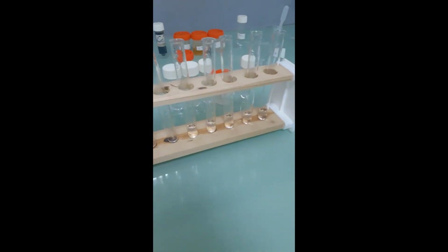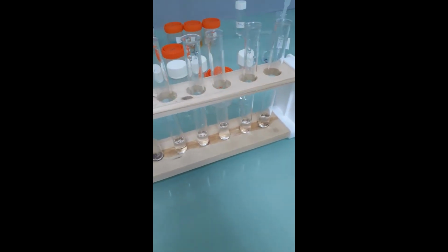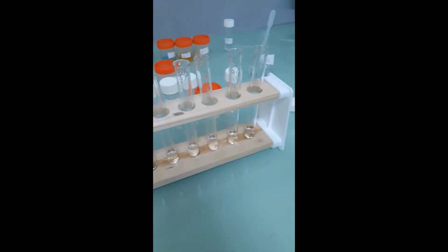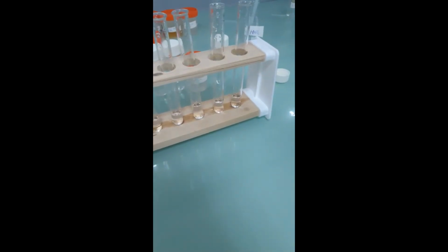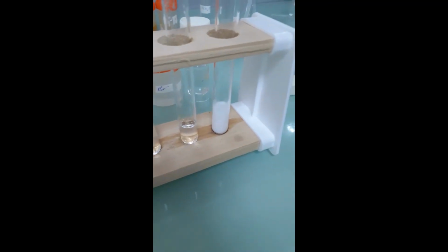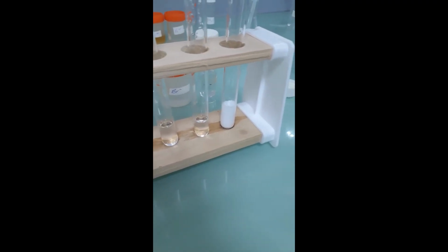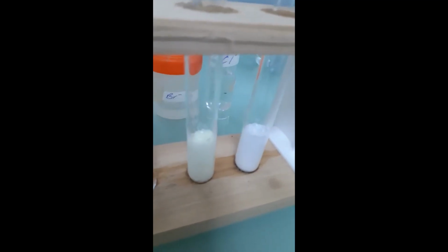Okay, so this is a test with silver nitrate solution. We're going to add it to chloride, bromide, iodide, sulfite, and carbonate. From your right to left. Let's go. That is chloride. Bromide.